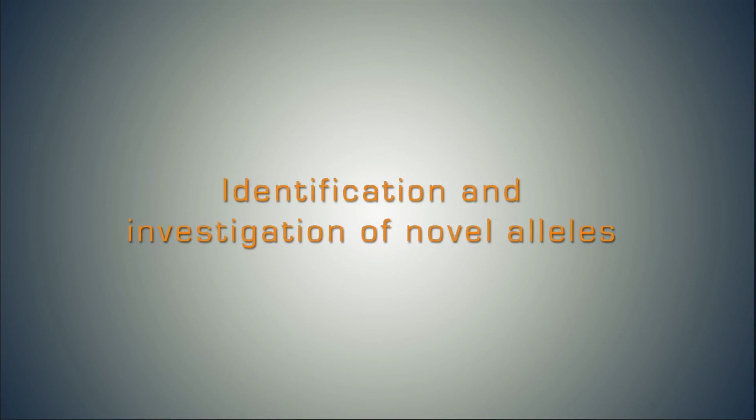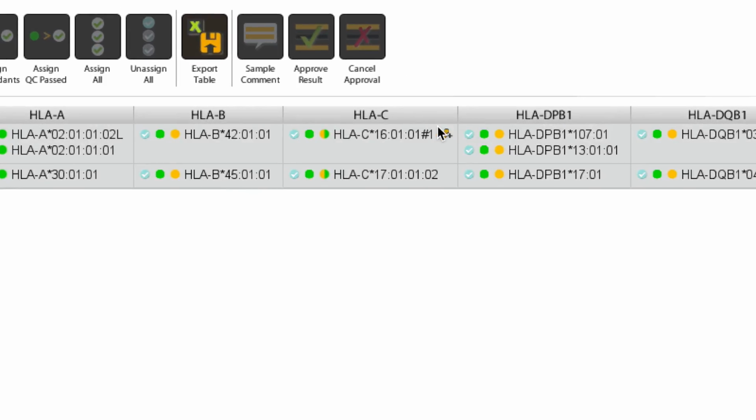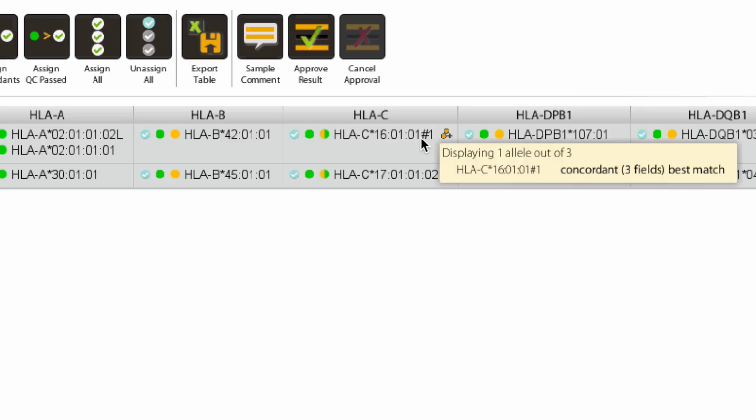In this short video, I am going to guide you through the identification and investigation of novel alleles. Alleles that are not present in the IMGT database. Identifying novel alleles is straightforward in HLA twin. They are always distinguished by an icon next to each novel allele, a special naming convention containing the closest related IMGT allele, a hash mark, and an additional number to identify the actual sequence.